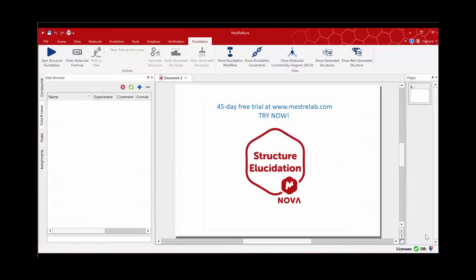Welcome to MestraLab. We're very excited to announce a new development which I'm about to show you. We have just implemented a computer-assisted structure elucidation — that's a CASE system in MNOVA 12. The aim of this video is to show you the MNOVA structure elucidation workflow, which will take you from NMR data to the best proposed structure.